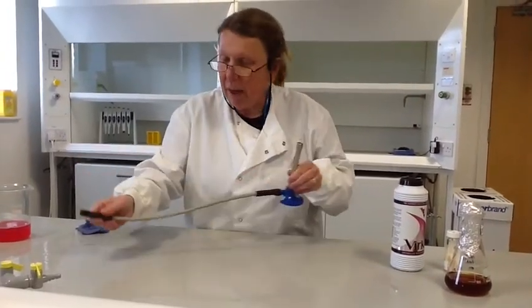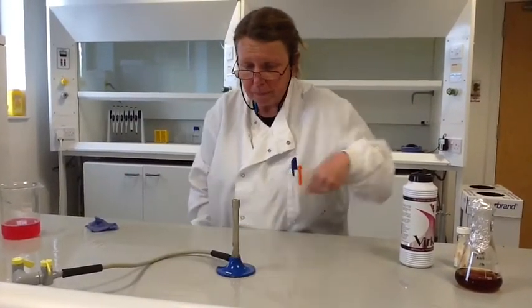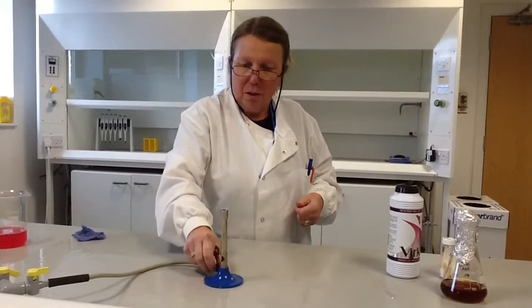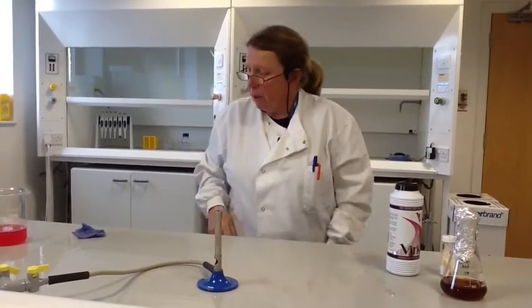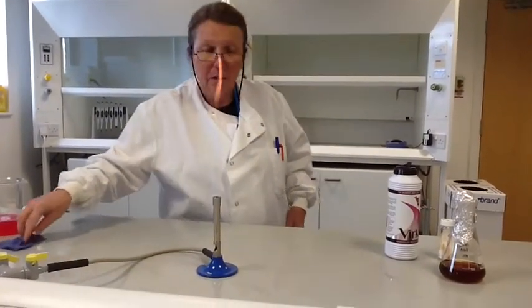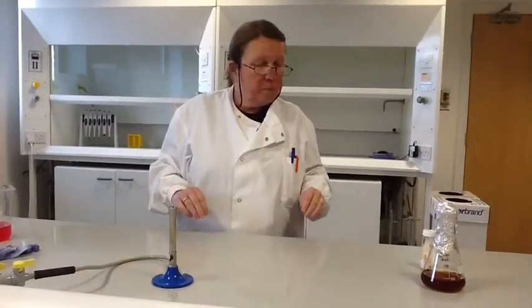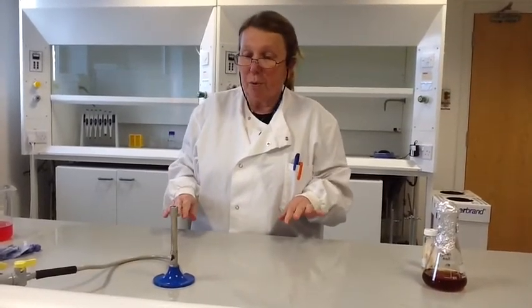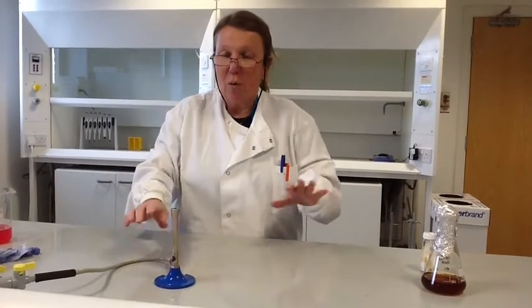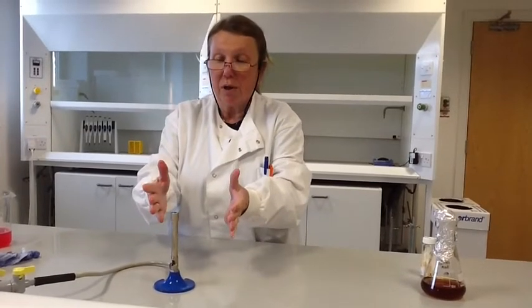Within our sterile area that we're creating, we're then going to put a Bunsen burner. By lighting a Bunsen burner, we're sterilising the air where we're going to work as well as the surfaces. When our Bunsen burner is on a blue flame, or a fairly hot flame, we get air currents around the Bunsen burner — we all know that heat rises.